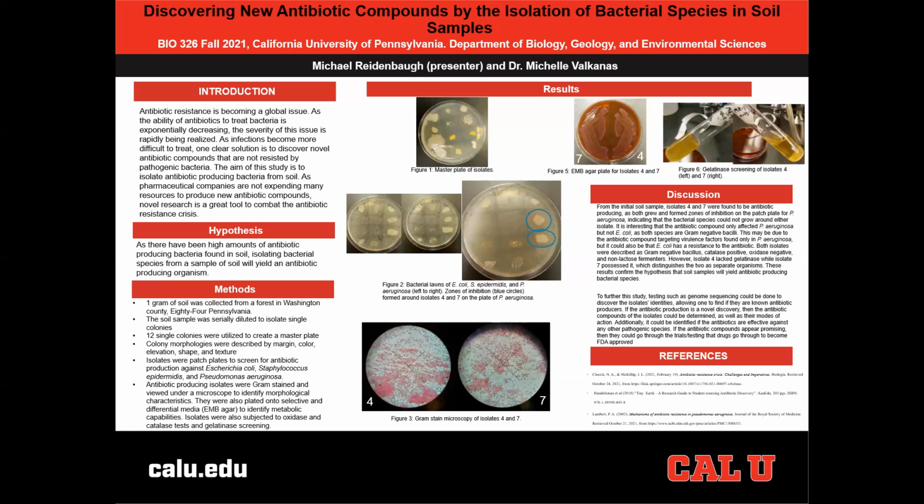And next, eosin methylene blue agar, both isolates were plated on that. And as you can see in figure 5, there is pink growth. This again confirms that they are gram-negative. However, since they're pink instead of a dark black purplish color, this shows that they are non-lactose fermenting.